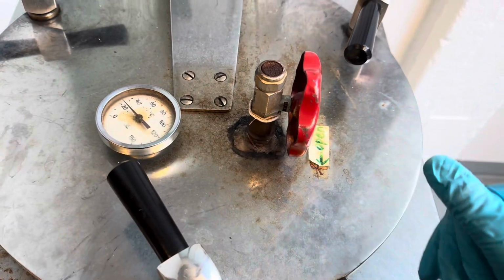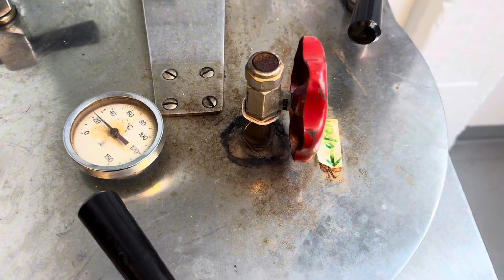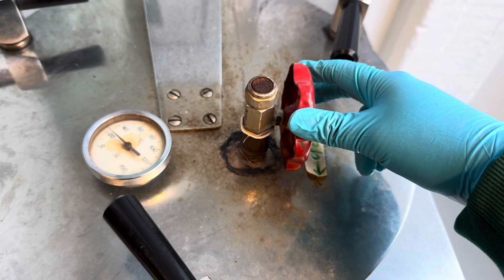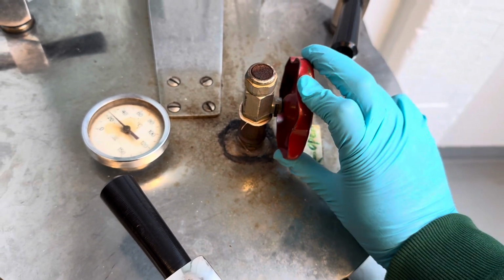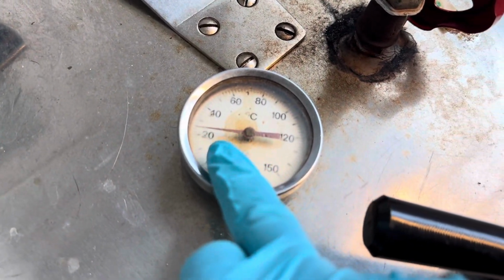Okay, another important thing is that now this valve is closed. I don't know if you can see, there is a hole. Now we have to turn it down and start the machine, and you can see this meter. Now it is at 20.